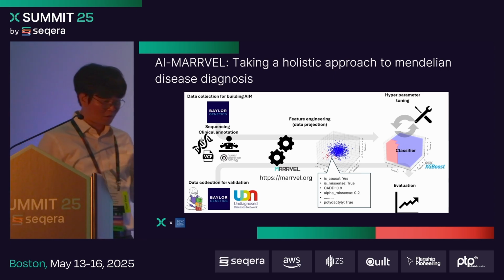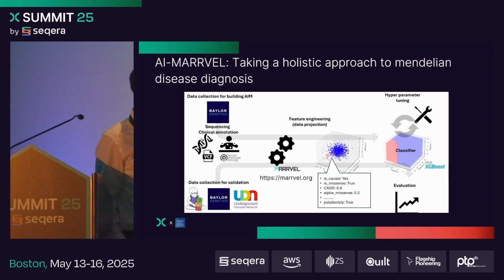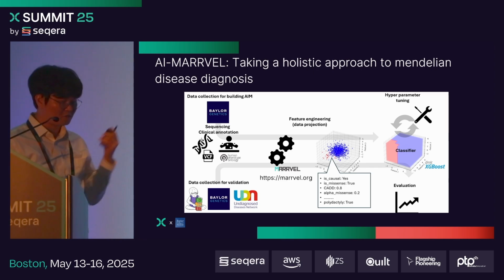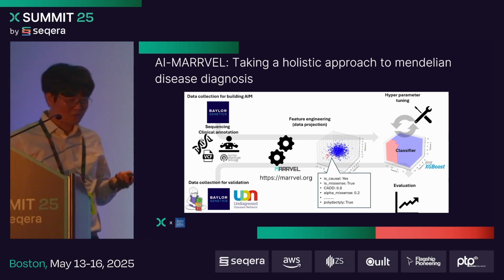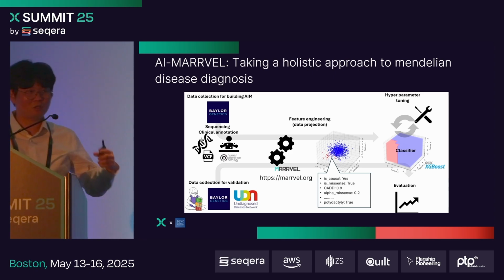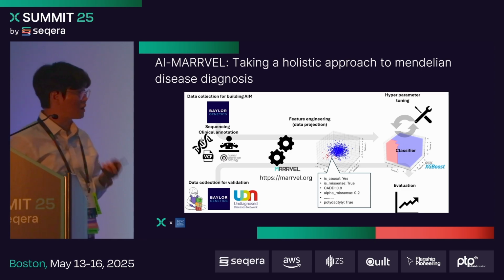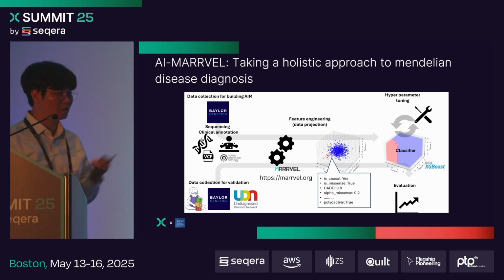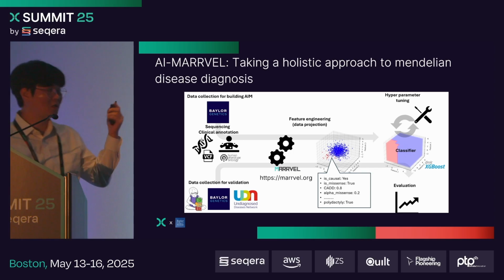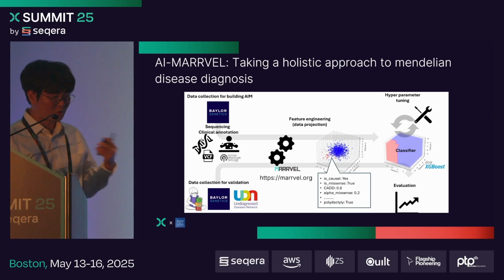After we take the VCF file, we encode each variant into a feature space. The feature space contains lots of information about the variant, which means that one single nucleotide variant becomes a vector. Using this vector, we build a model with XGBoost to predict whether this variant is causal or not, and associated with the phenotype for the sample.